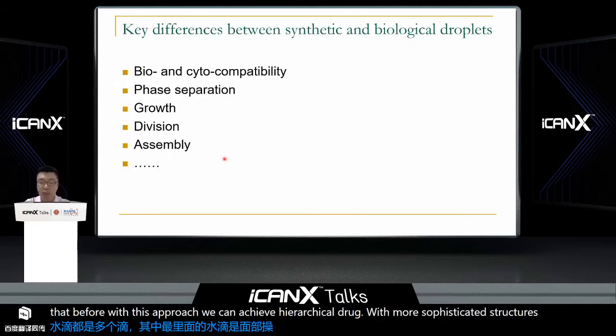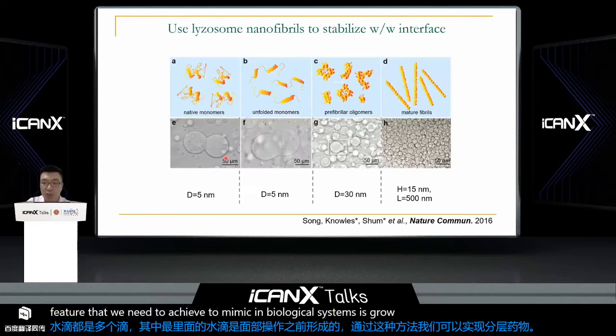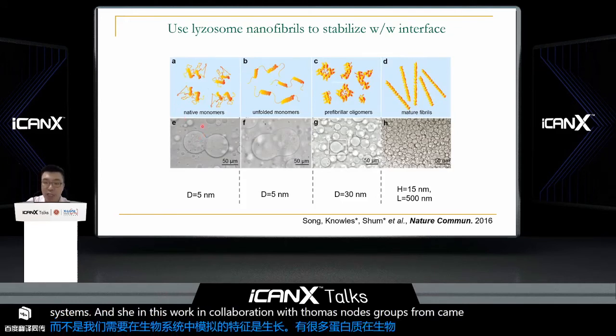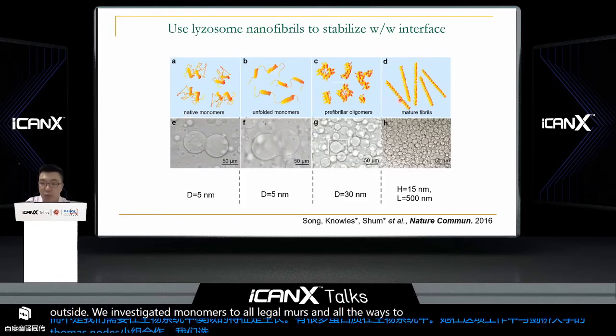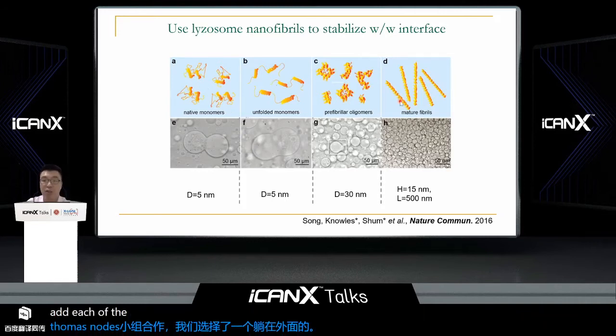Another feature that we need to achieve to mimic in biological systems is growth. There are lots of proteins in biological systems, and in this work, in collaboration with Thomas Knowles' group from Cambridge University, we chose lysozyme. We investigated monomers, oligomers, and all the way to these nanofibrils, and we tried to add each of these to stabilize the aqueous droplets in aqueous solutions.